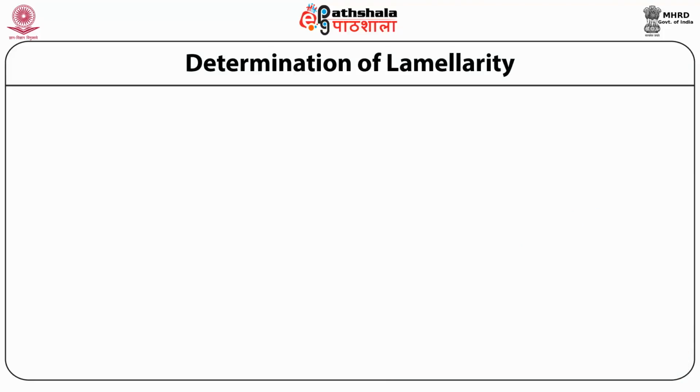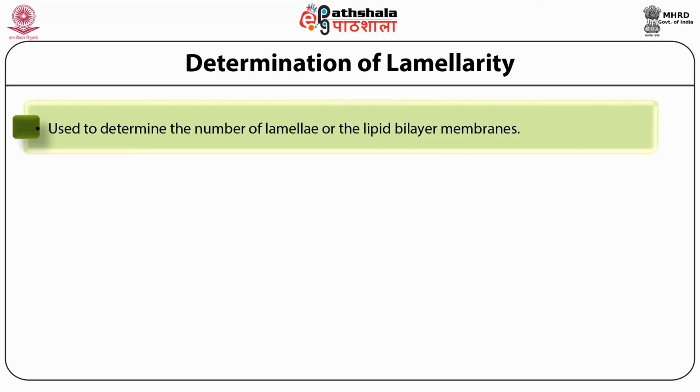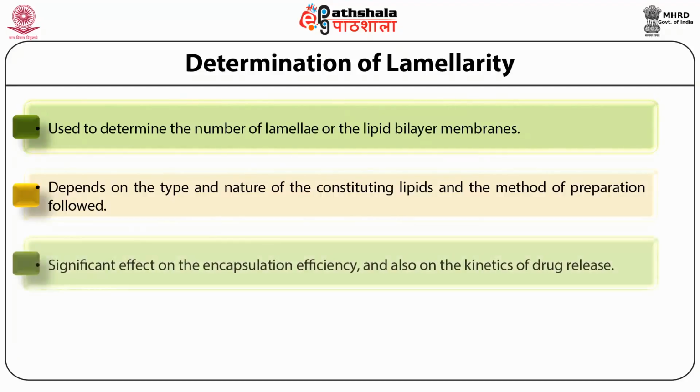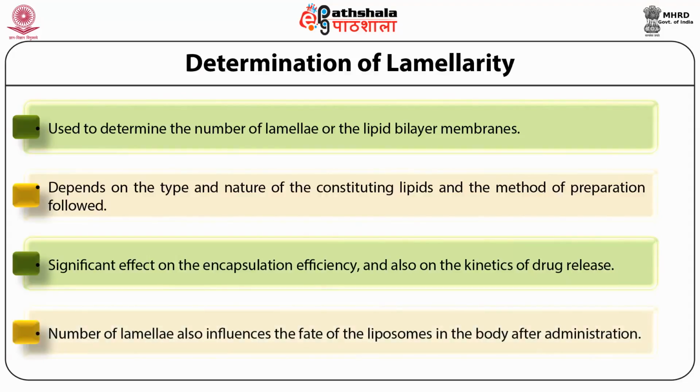Determination of lamellarity. In lamellarity determination, the number of lamella or the lipid bilayer membranes present in the liposomes is determined. Lamellarity widely varies and depends on the type and nature of the constituting lipids and the methods of preparation followed. Lamellarity is an important aspect to be analyzed as the number of lamella has a significant effect on the encapsulation efficiency and also on the kinetics of drug release.